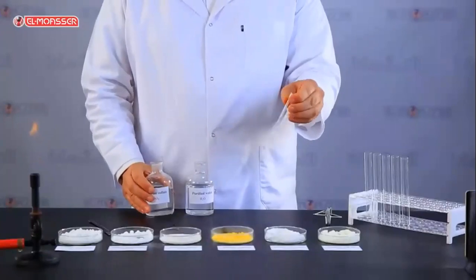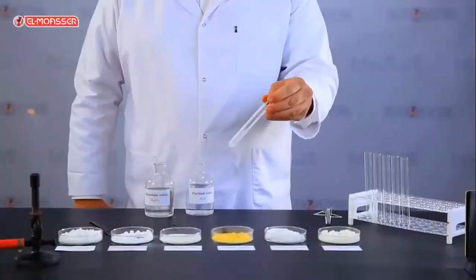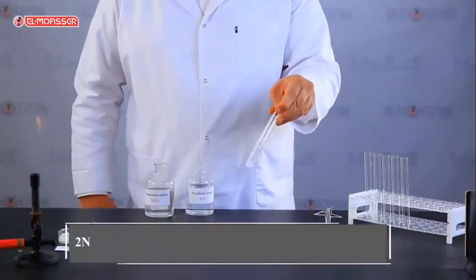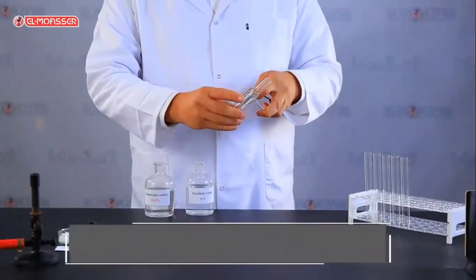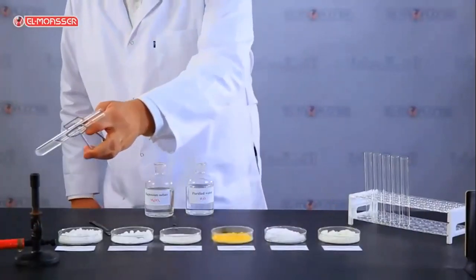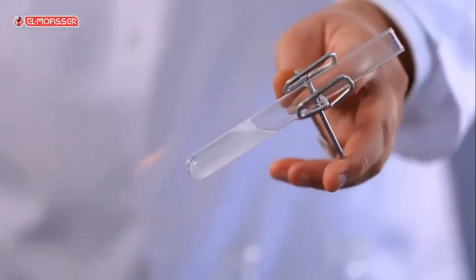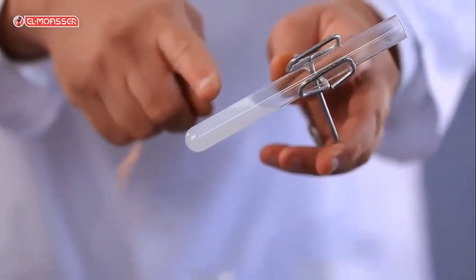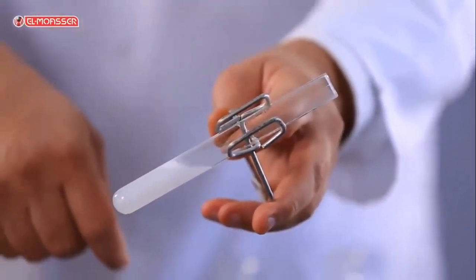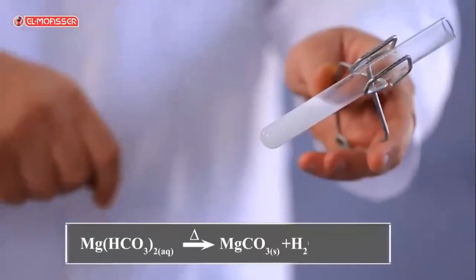Why isn't a white precipitate formed on cold, as in the case of sodium carbonate solution? Because the produced magnesium bicarbonate salt solution is soluble in water. Do you think a white precipitate is formed after heating? Yes. The white precipitate is formed after heating due to the change of magnesium bicarbonate into magnesium carbonate, which is insoluble in water.